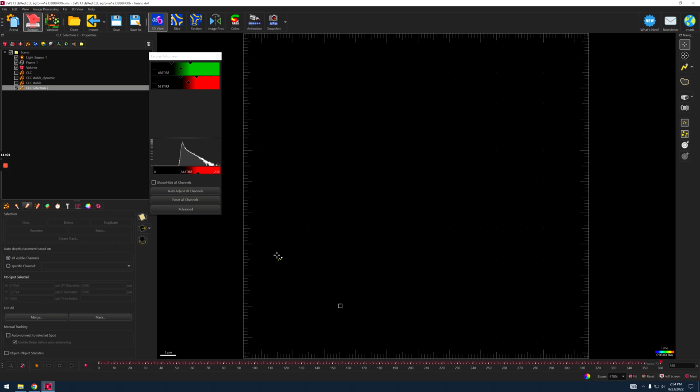Now you have a spot module of the tracks that appeared or disappeared sometime during the time of your imaging. So this channel, we rename it to be dynamic.